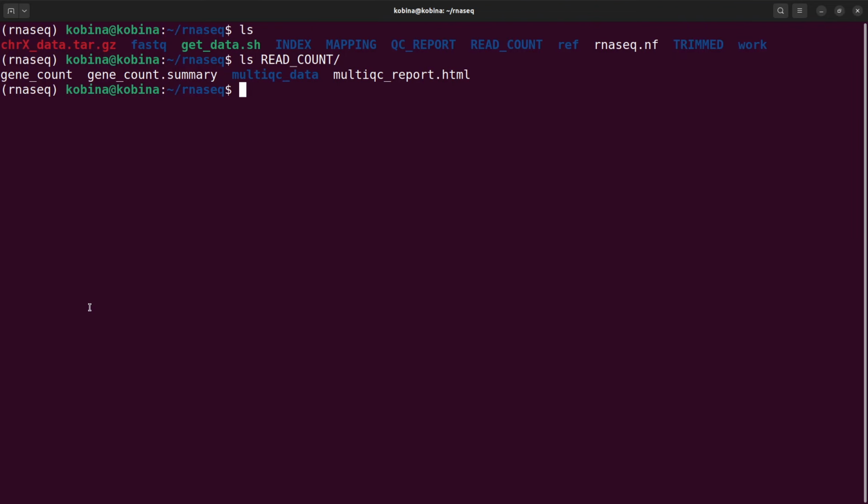And also don't forget that with Nextflow, it always generates this work directory. So what you want to do is to remove this directory. So I'll say rm -fr work to remove it because it will contain duplicate data which we don't need. So I'll remove it nicely and I'll now have all these which are now my outputs.